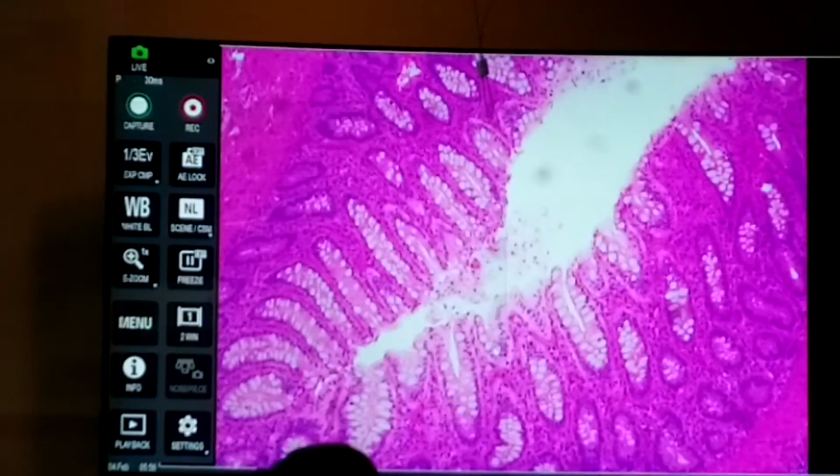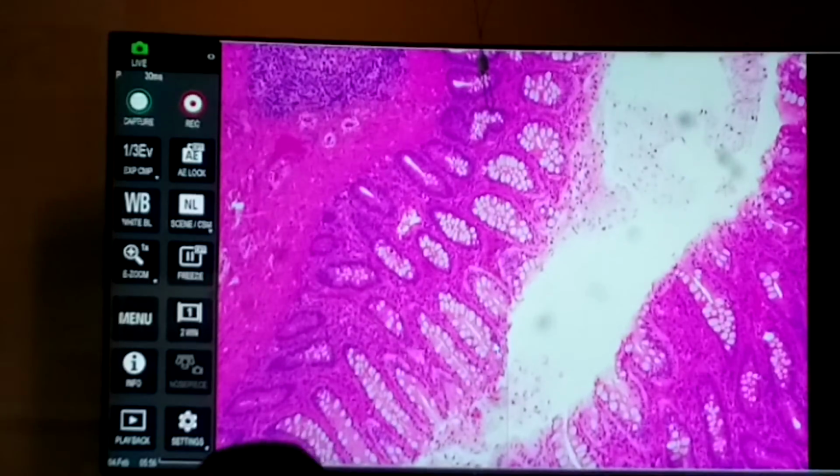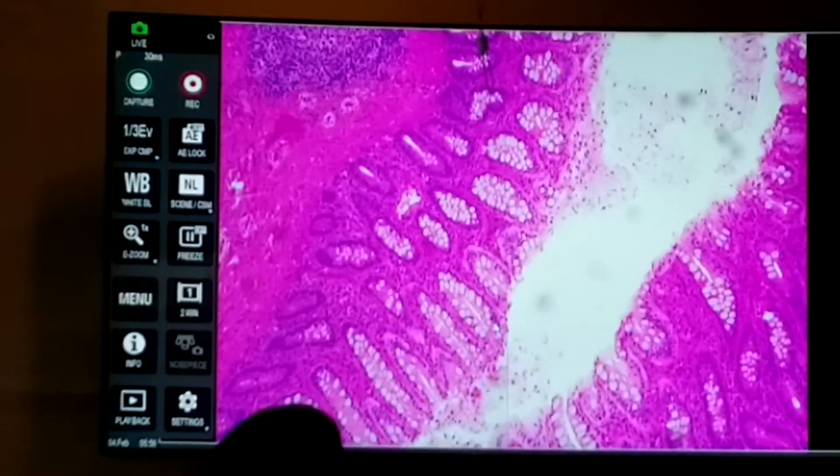So yeah, these are straight tubular glands. Because they're so straight, you don't see a bunch of cross sections like you would see with a coiled tubular gland, like a sweat gland. Okay?